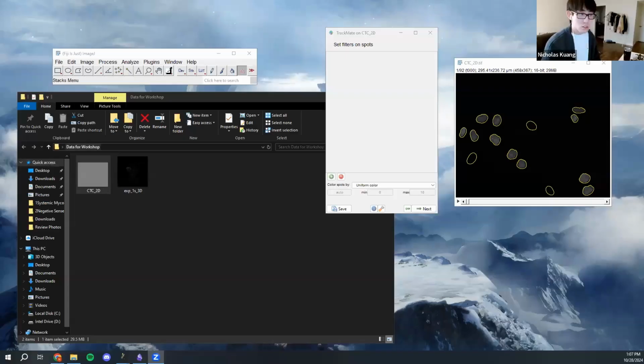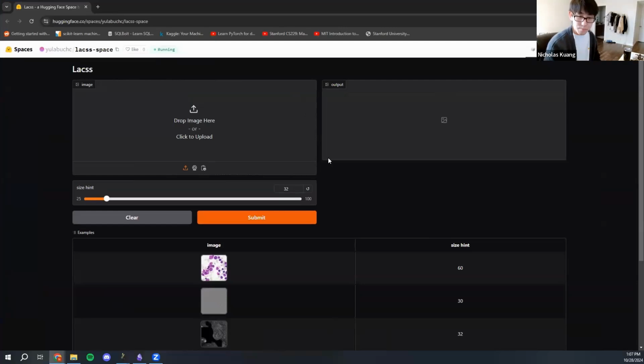Hello, everyone. We're going to start off with the website that we developed on the cloud to test your own data real quick, just in case anyone wants to follow along with their own data. Let me share my screen. There should be a link in the chat that links to Hugging Face, which brings up something like this.